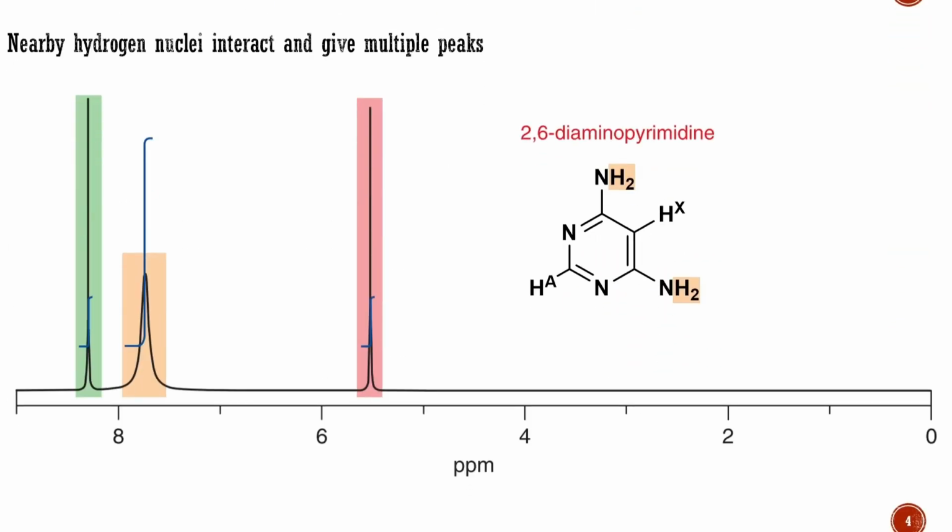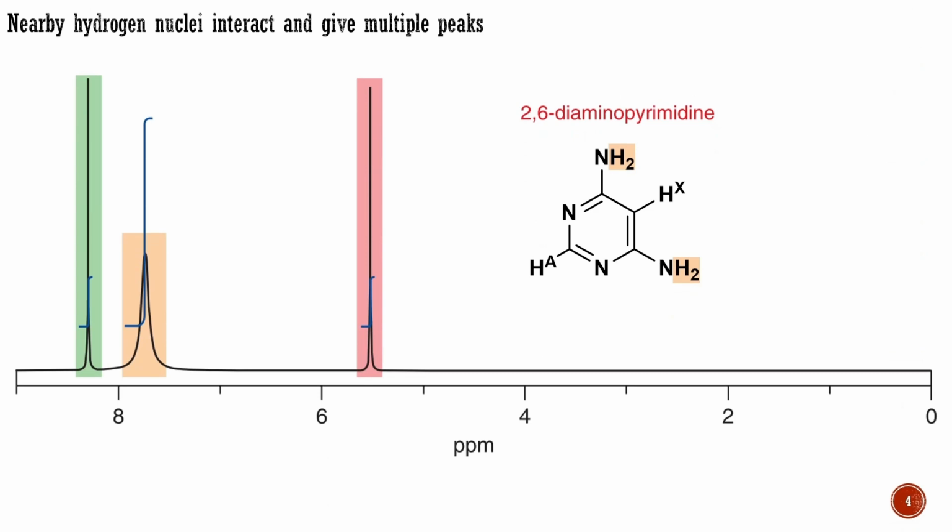You might have expected a spectrum like that of the heterocycle shown here, which like cytosine is also a pyrimidine. This one also has exchanging NH2 protons and 2 protons on the heterocyclic ring. But unlike cytosine, these two protons give the expected 2 lines, or singlets, for the aromatic protons instead of the 4 lines in the cytosine spectrum. It is easy to assign this spectrum.